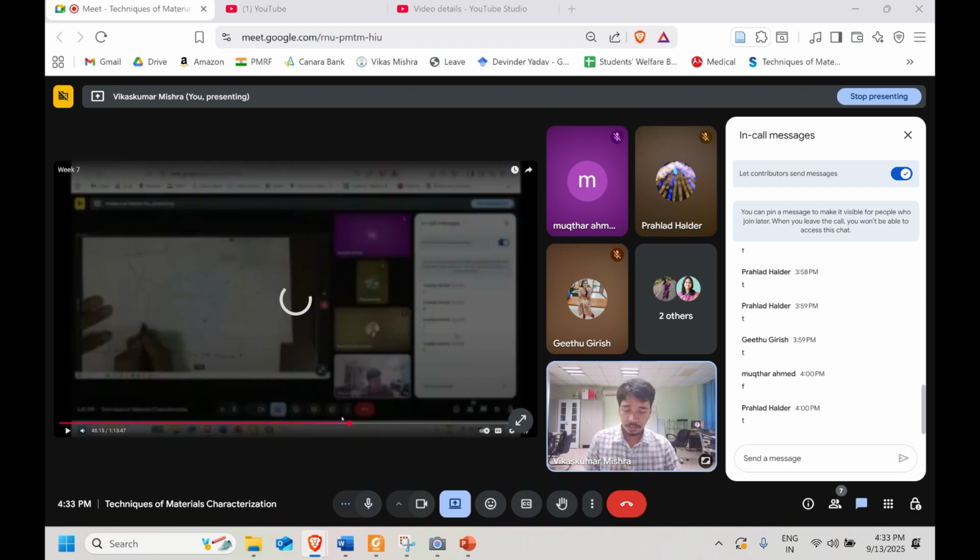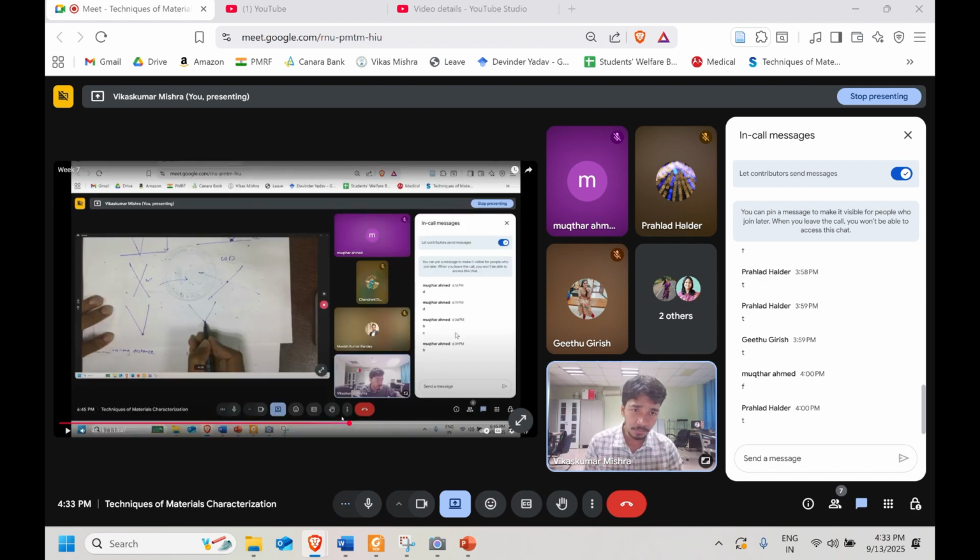All you are doing when you say that you are going to a higher magnification is going to a better resolution. The image you get has a better resolution, as long as it's effective. And everything we have discussed till now in the class and in these discussions is just the effective magnification we are talking about.